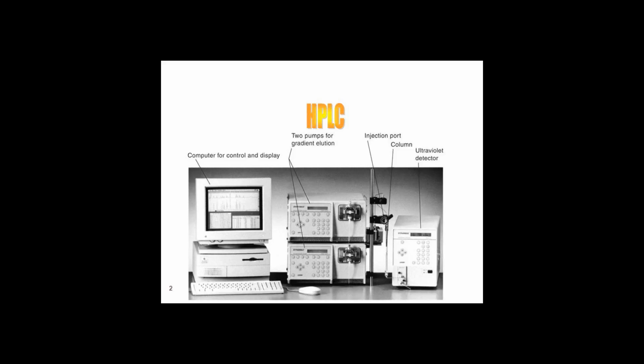Bioaffinity chromatography. This chromatographic process relies on the property of biologically active substances to form stable, specific, and reversible complexes. The formation of these complexes involves the participation of common molecular forces such as the van der Waals interaction, electrostatic interaction, dipole-dipole interaction, hydrophobic interaction, and the hydrogen bond. An efficient, biospecific bond is formed by a simultaneous and concerted action of several of these forces in the complementary binding sites.